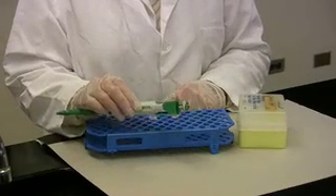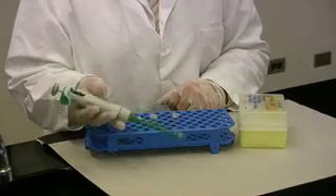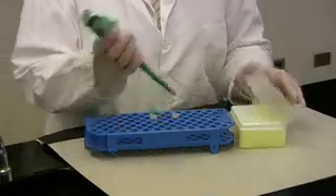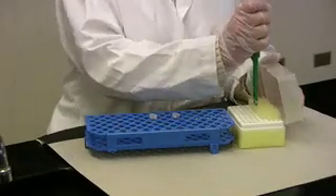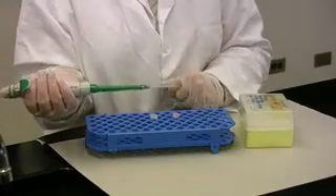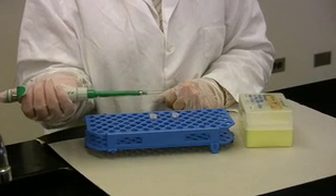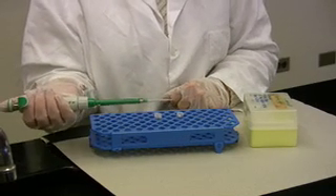The range of this micropipetter is between 20 and 200 microliters, so I know I have the correct pipetter. The next thing I want to do is to add the pipette tip. Make sure that the tip is securely on the micropipetter — you do not want to be losing your tip during the transfer process.